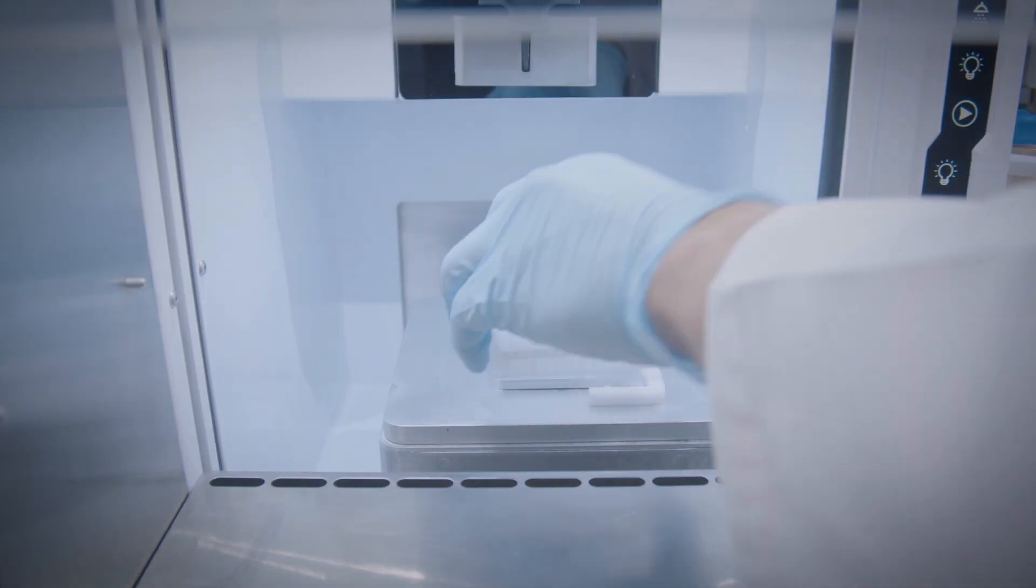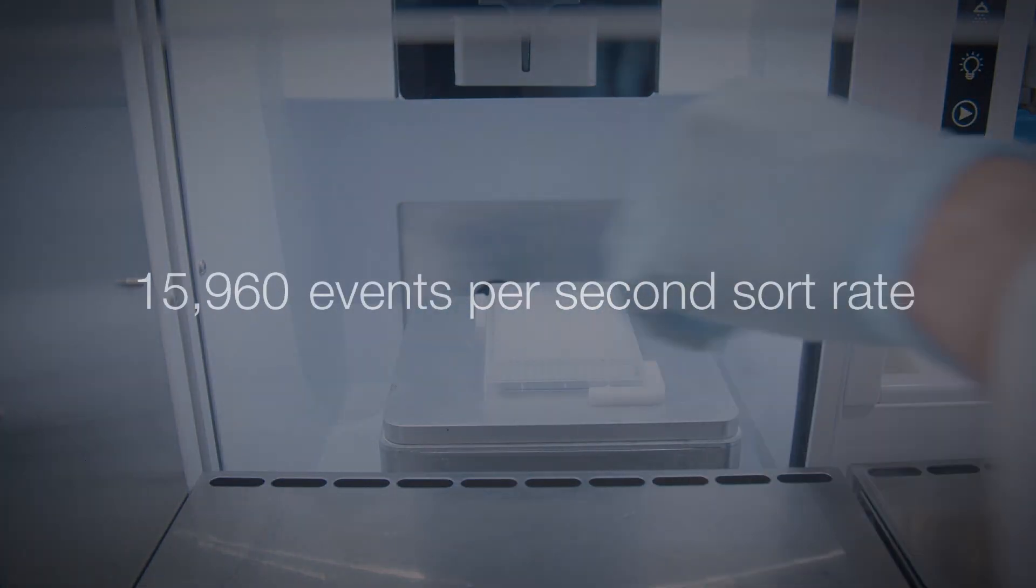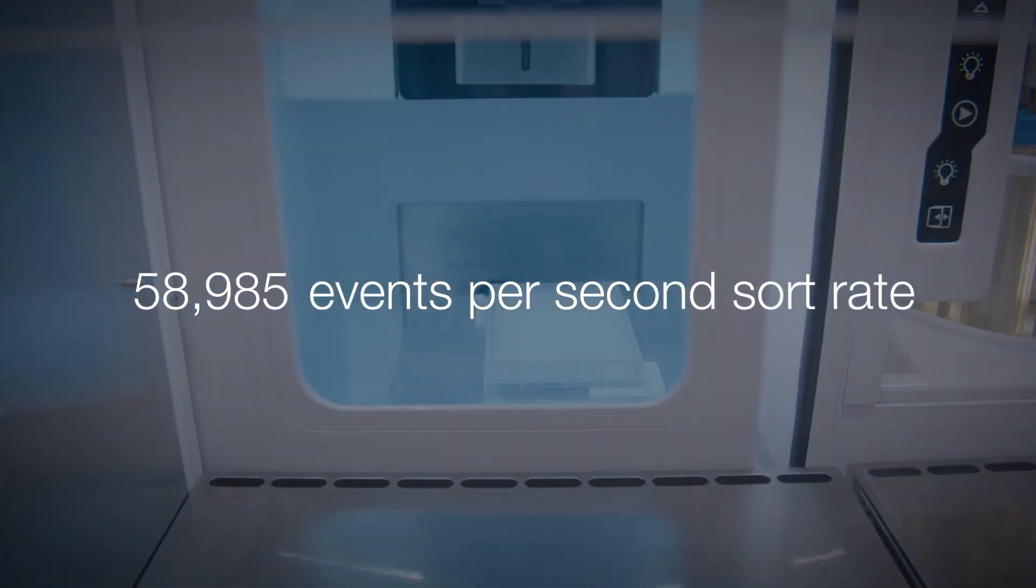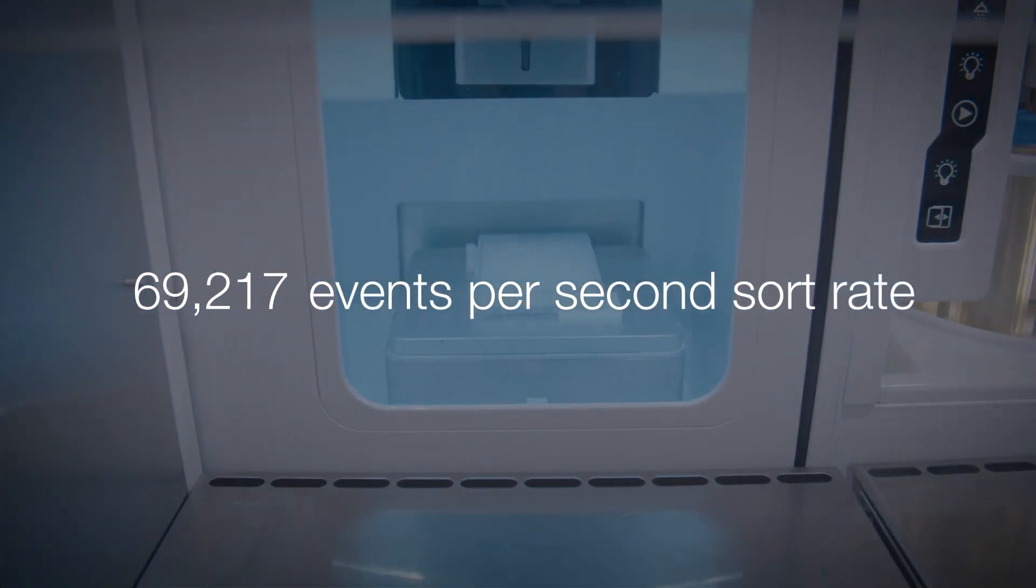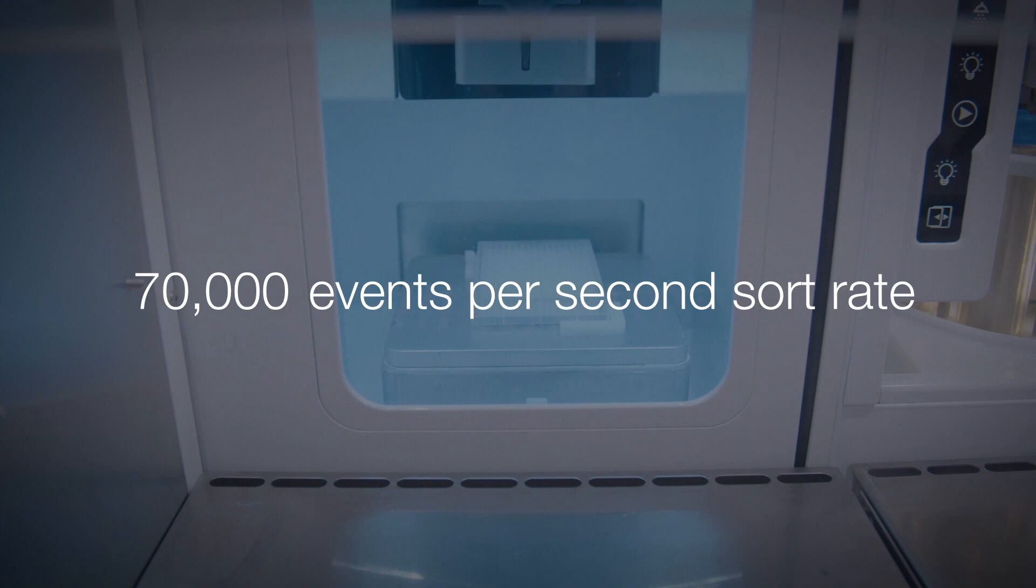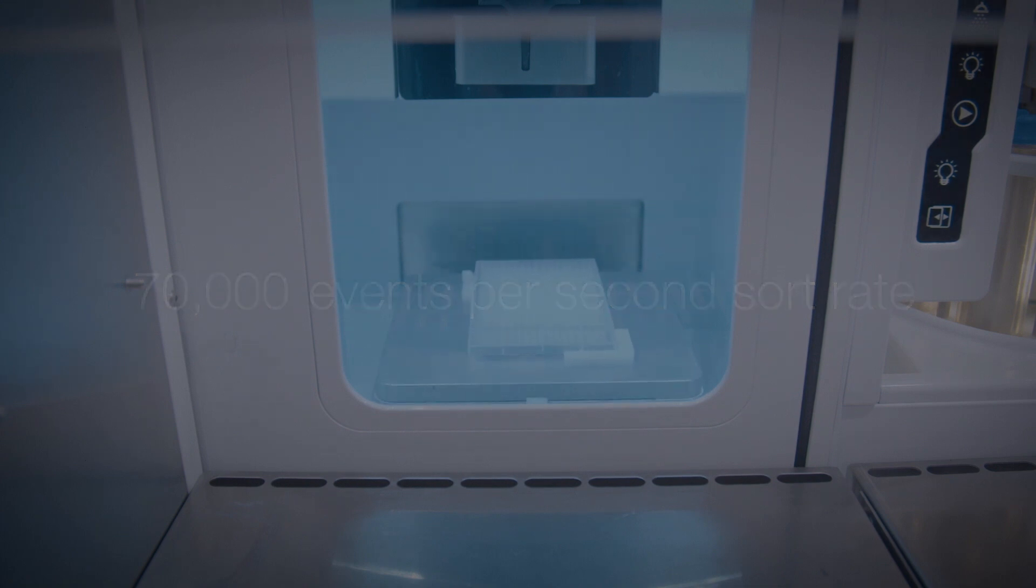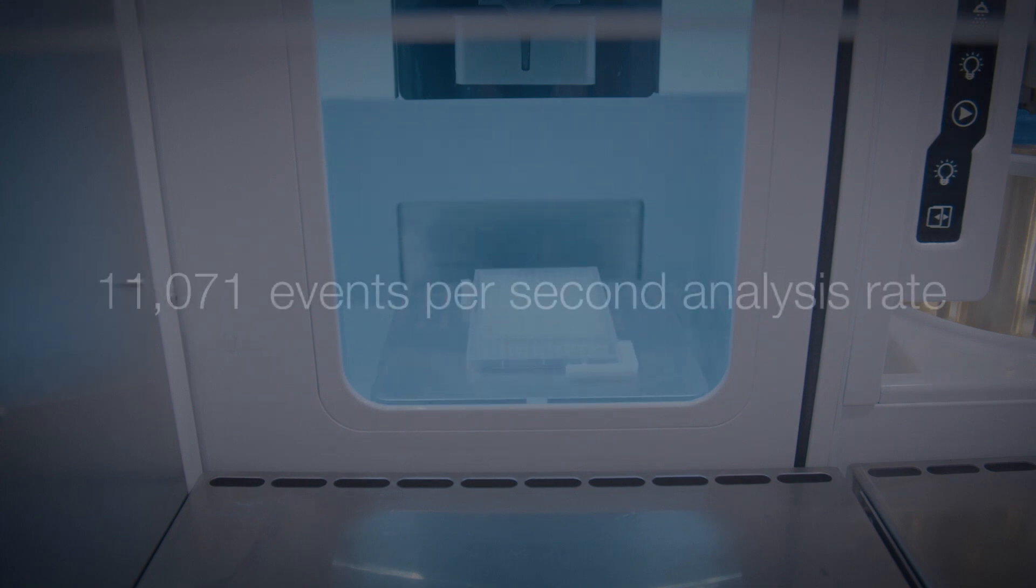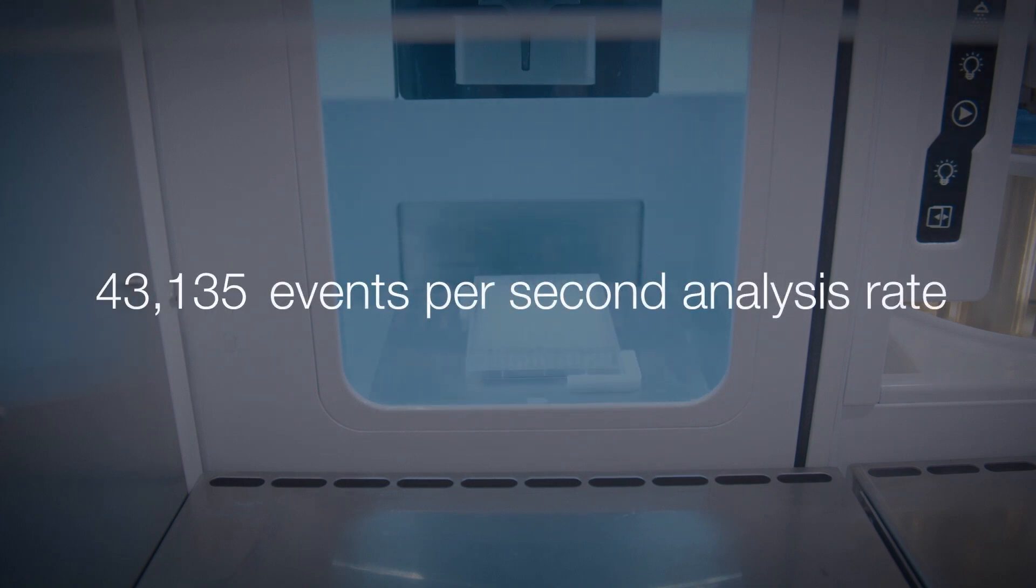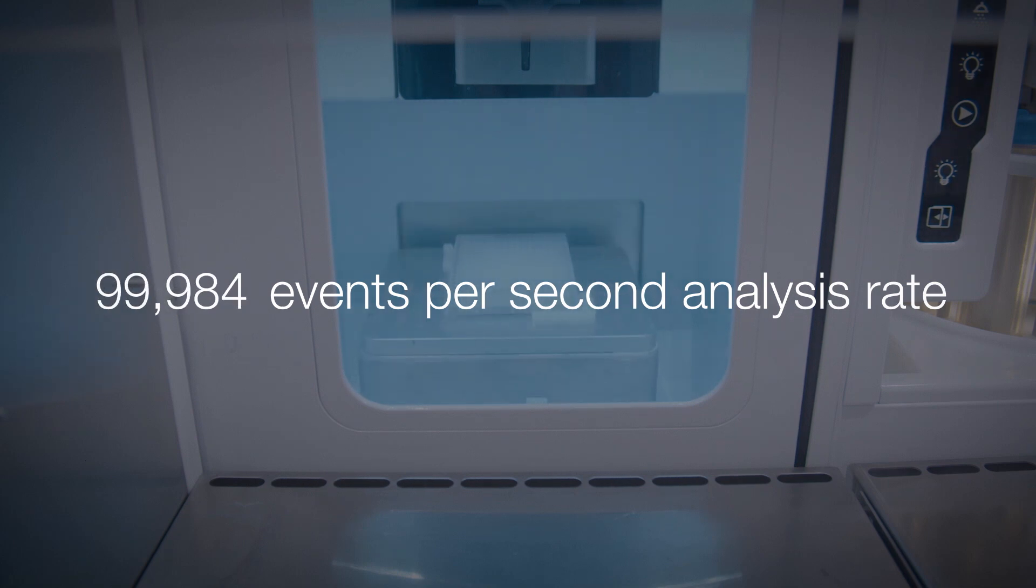With the Invitrogen Bigfoot Cell Sorter, researchers can run experiments using both spectral or conventional flow cytometry and develop panels with a choice of up to 60 parameters that can sort six populations simultaneously.